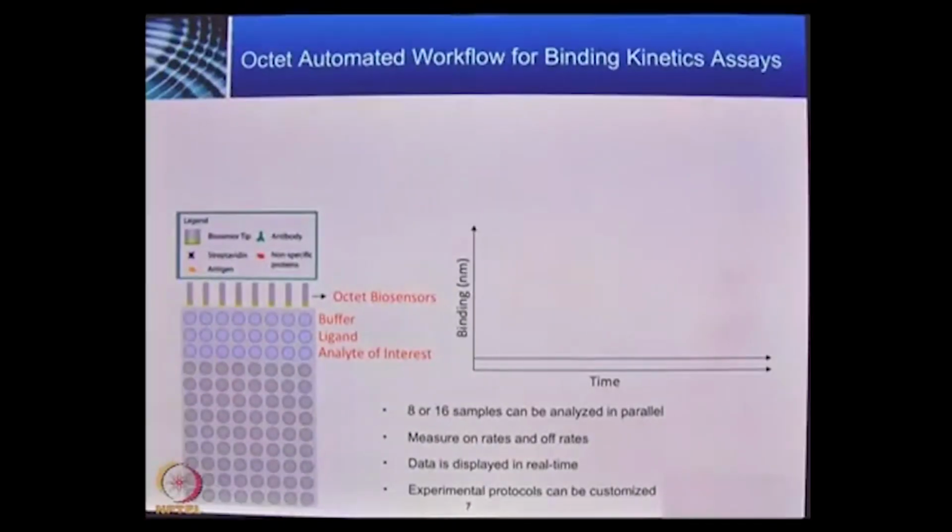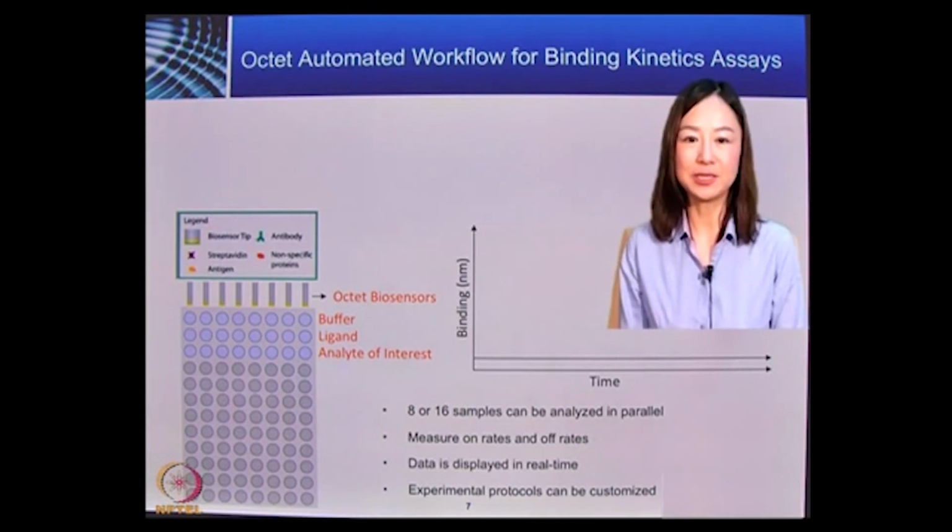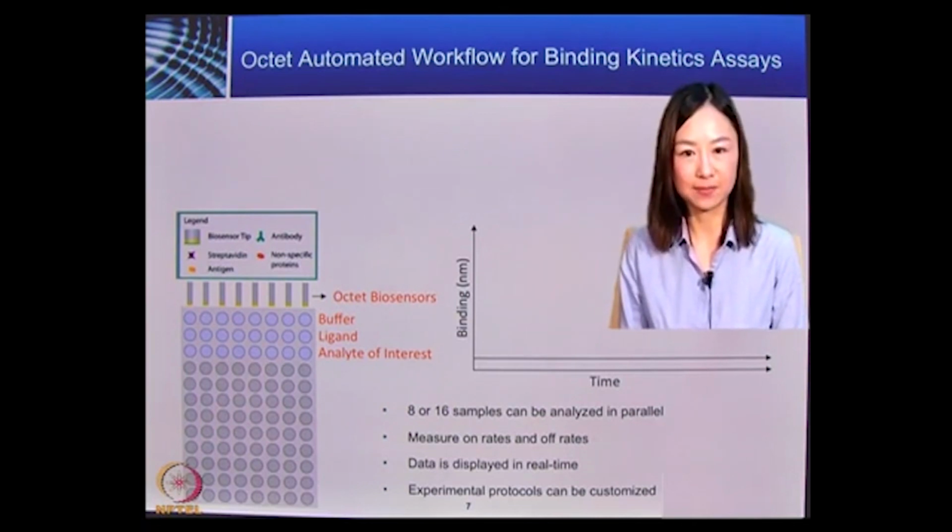When we're doing a kinetic experiment, we firstly need to coat the biosensor with a ligand. In this experiment, we are using biosensors with streptavidin immobilized on them.